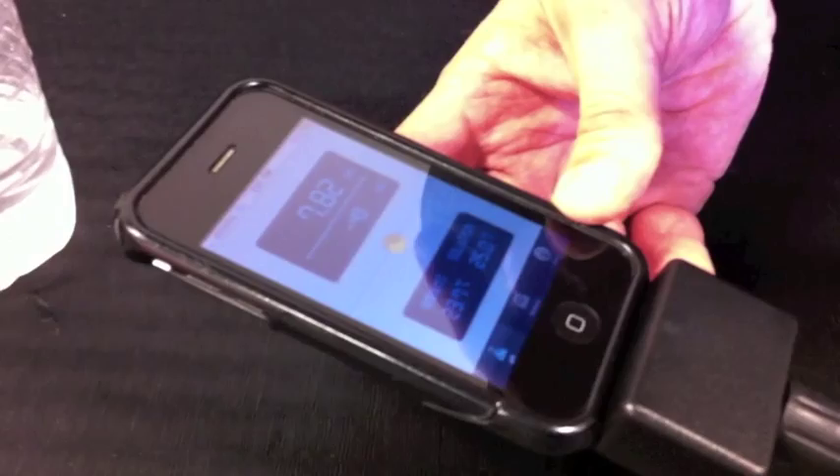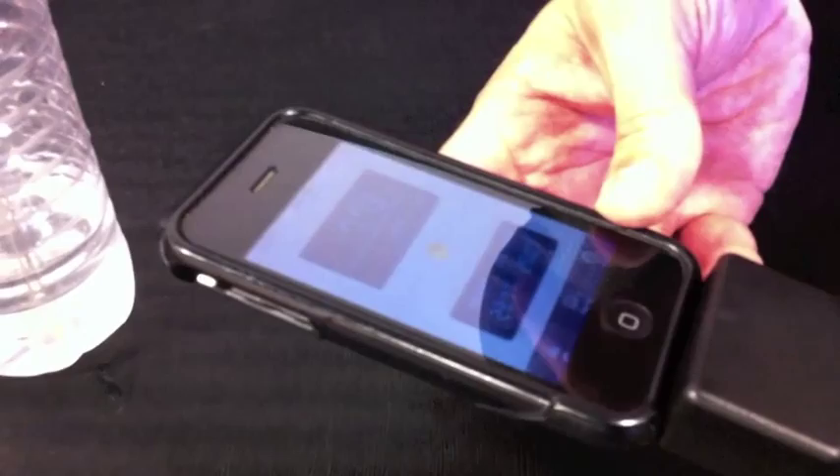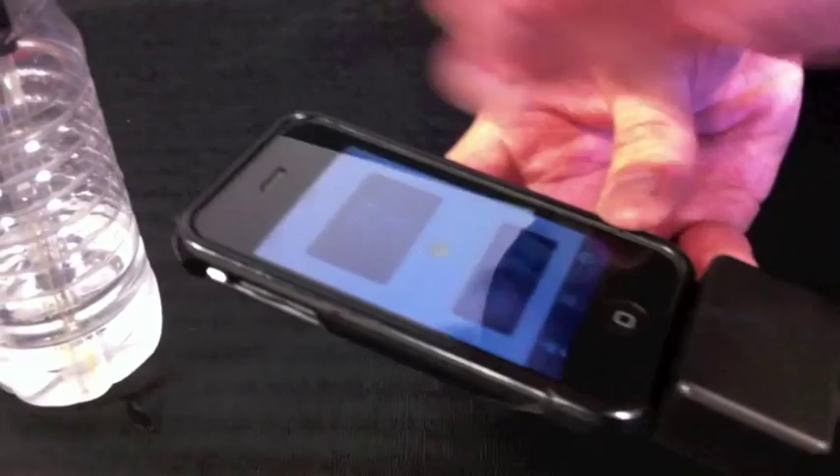This is intended for use in the field for people who are testing ground water, well water, things like that — in locations where they need to know the value of the PH, they need to know when the reading was taken, and they need to know where it was taken. The iPhone is a perfect unit for that with its built-in GPS.